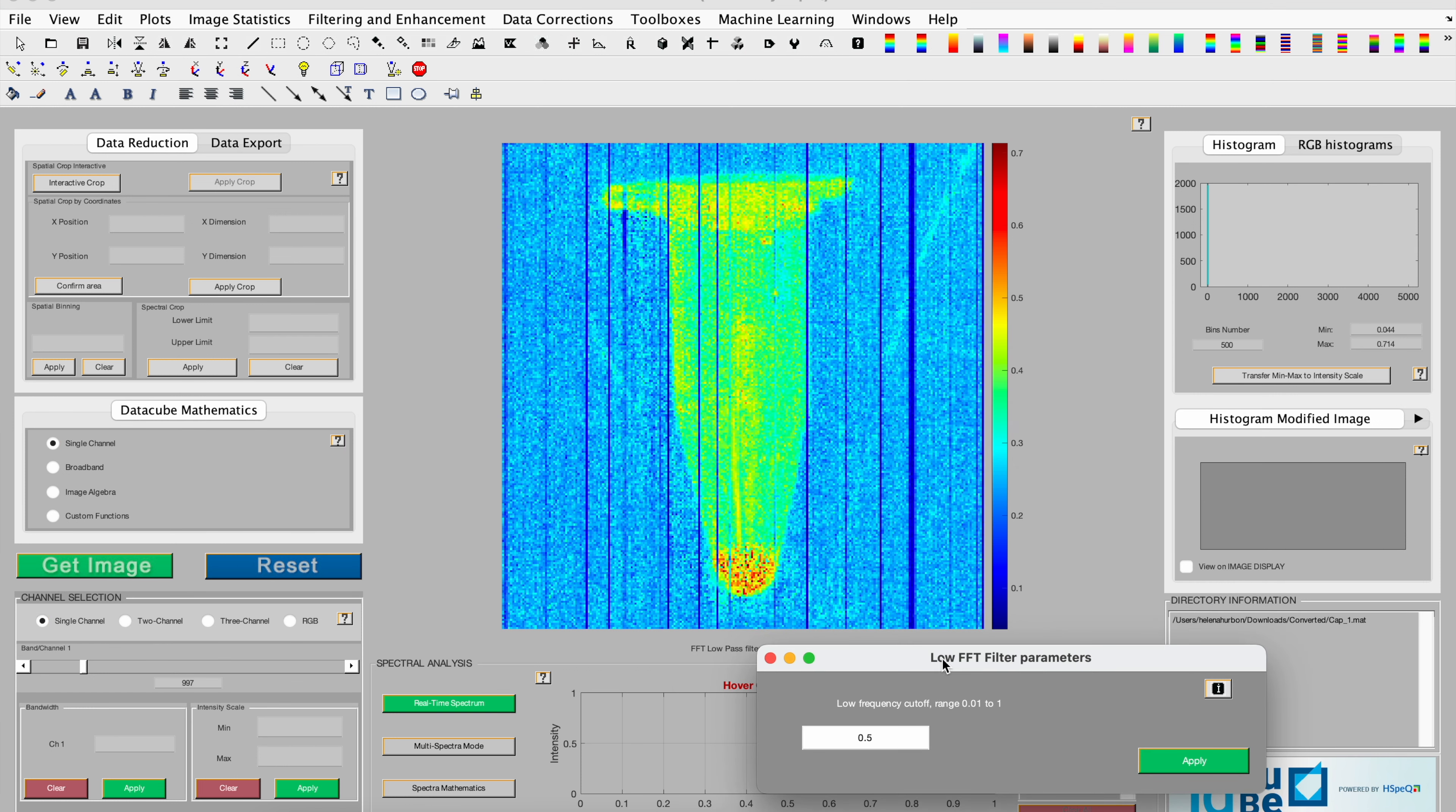The resulting image with 50% cutoff high frequencies will be shown in the image display right here.